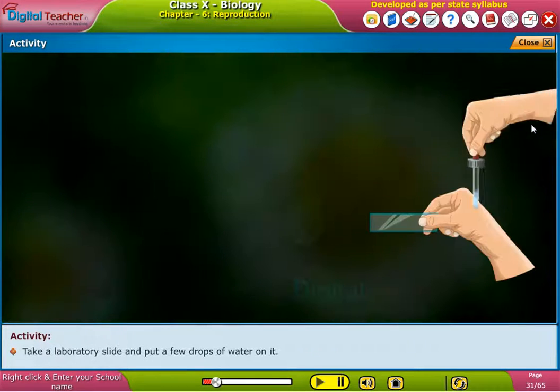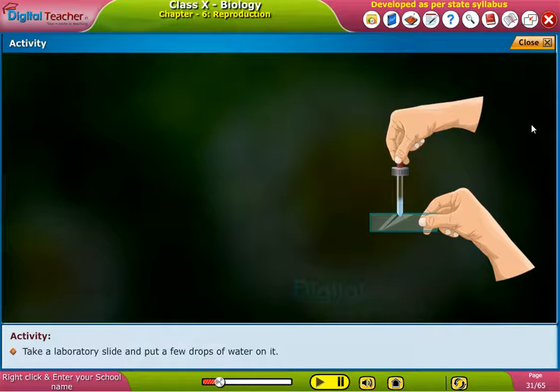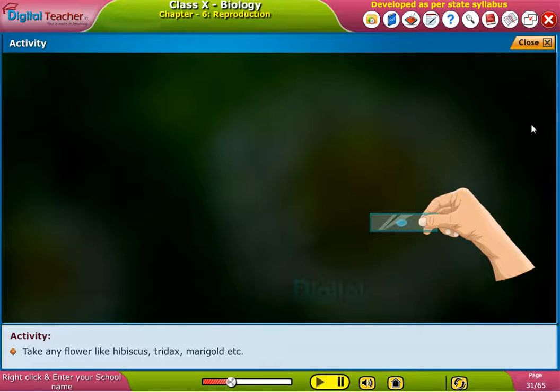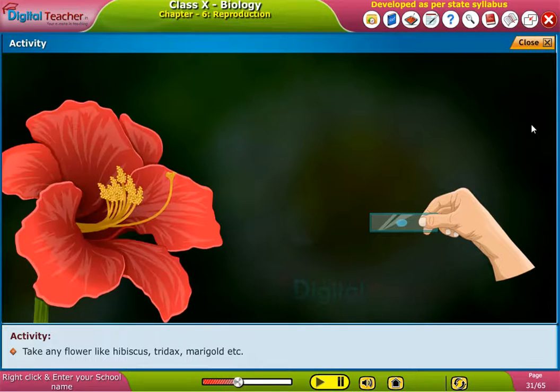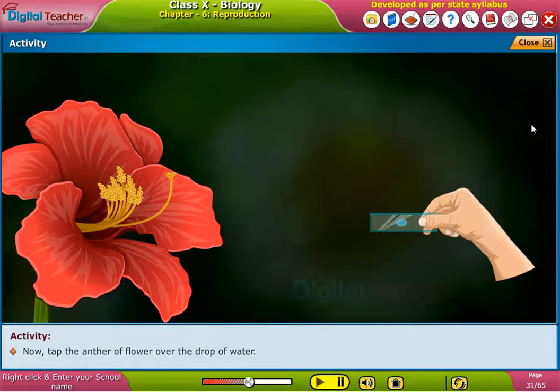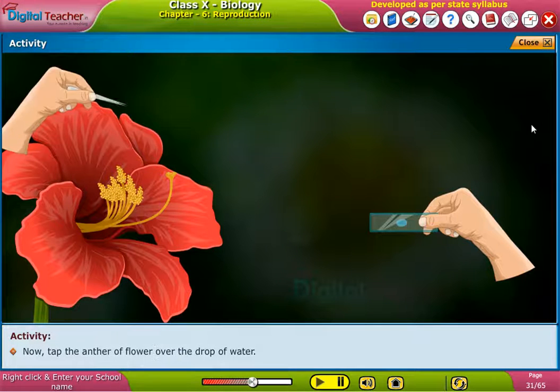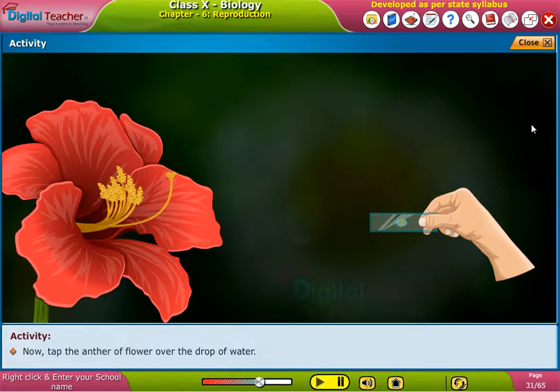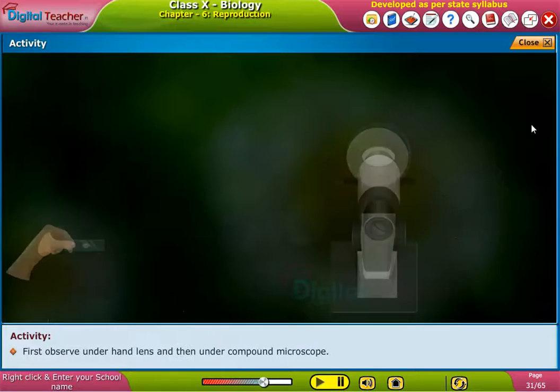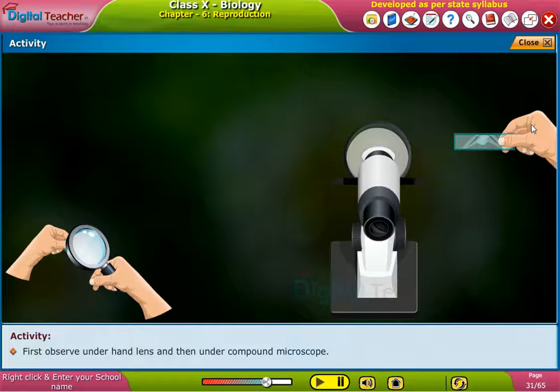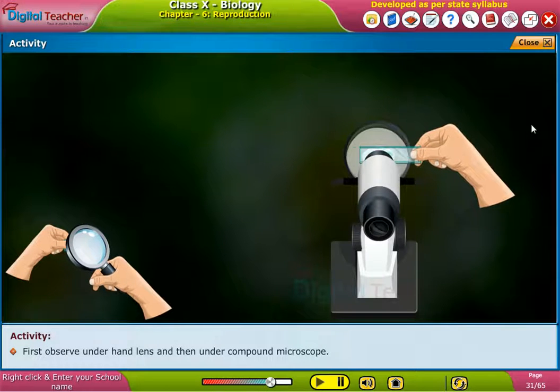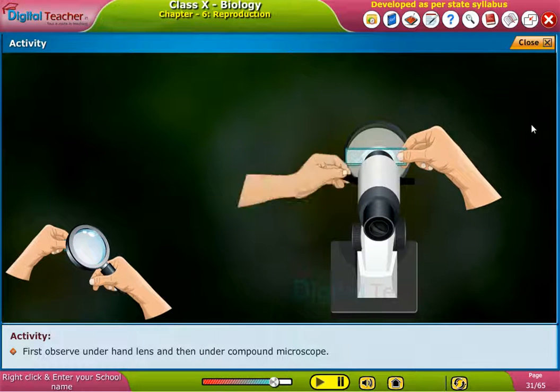Take a laboratory slide and put a few drops of water on it. Take any flower like hibiscus, tridax, marigold, etc. Now tap the anther of the flower over the drop of water. First observe under a hand lens and then under a compound microscope.